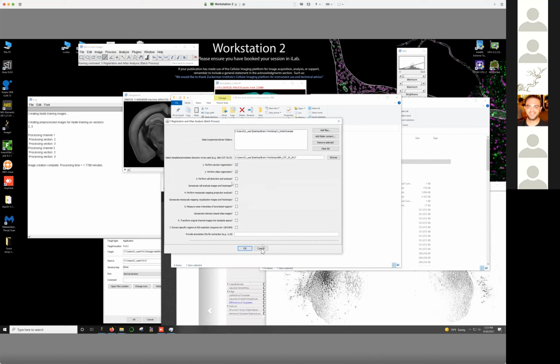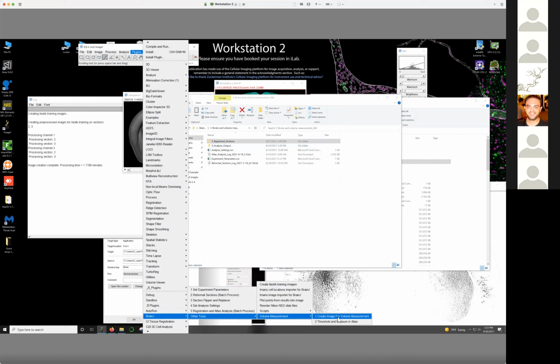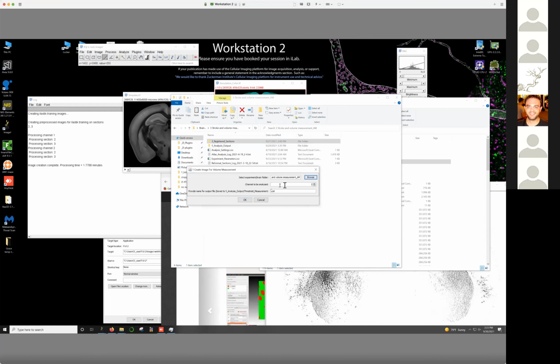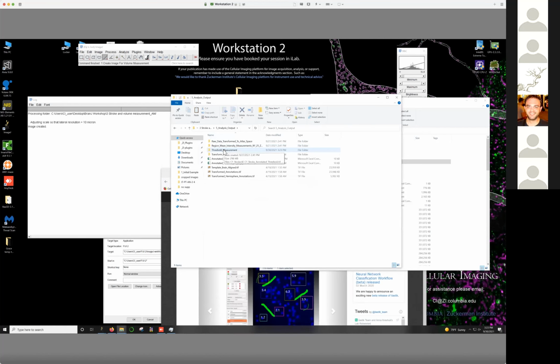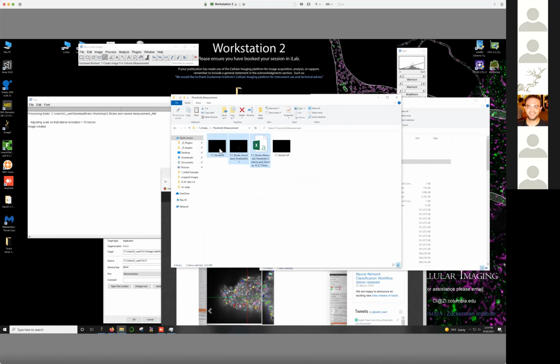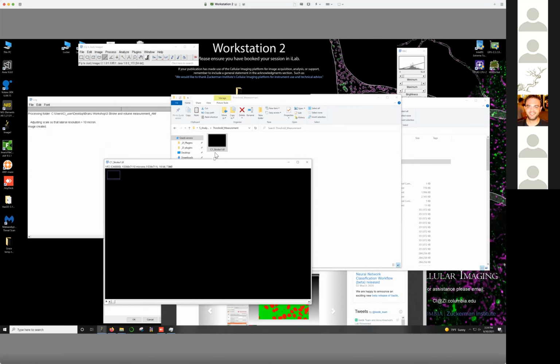And then we don't need to do any of these steps here. But to measure that volume, we can go in and use this separate tool. We would say other tools, volume measurement, create an image for the volume measurement. Let me select that folder again. Select a channel, and I can give it a name. This will create a slightly scaled down image and save it in the folder here. There'll be a folder called threshold measurement in here. I just ran this earlier, so let me get rid of this. It'll include the channel name, so it's channel 1 and then the name that I gave it.